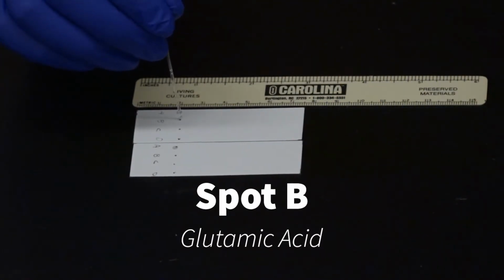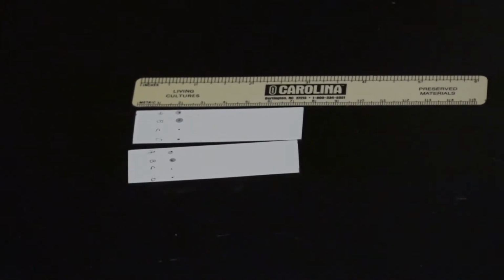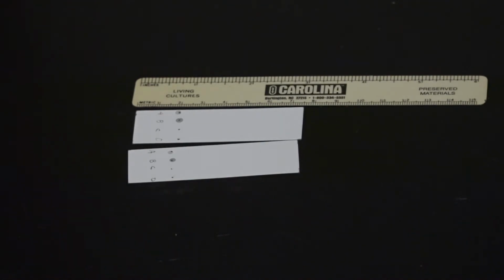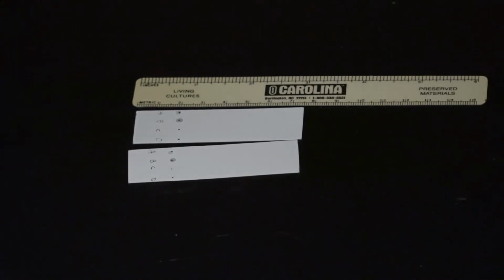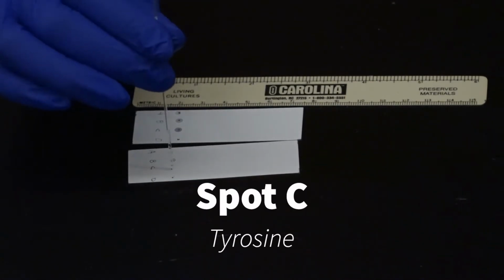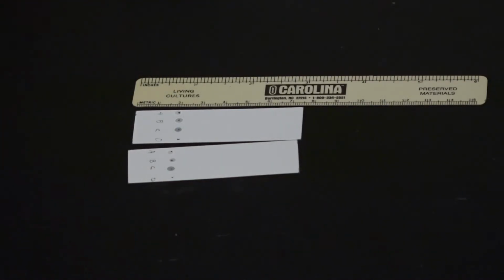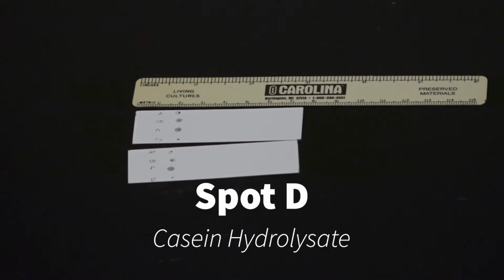Here comes B. And next up is tyrosine. And lastly, our mystery amino acid, otherwise known as casein hydrolysate.